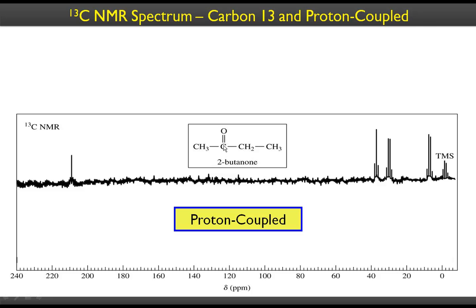And so how many should this be? This doesn't have any magnetically active nuclei, so it gives a singlet. And this has 3 magnets attached to it, so this would give a quartet. Because of these 3 local magnetic fields, the probability of arranging these 3 magnets is 4 possible ways, right? So because of that we get quartet for that particular carbon, and that is this quartet. This quartet is much high field. Upfield, right? Sorry, this one, that's TMS.